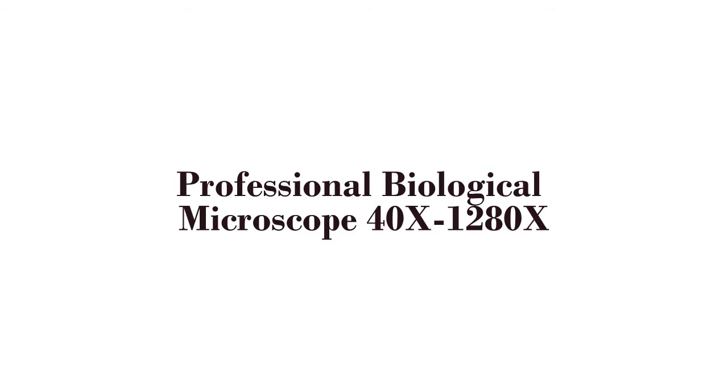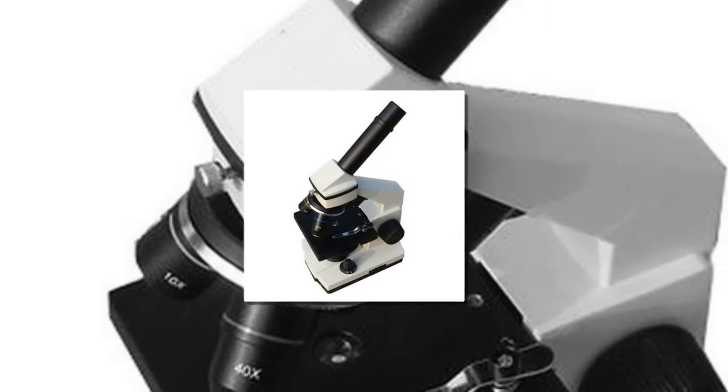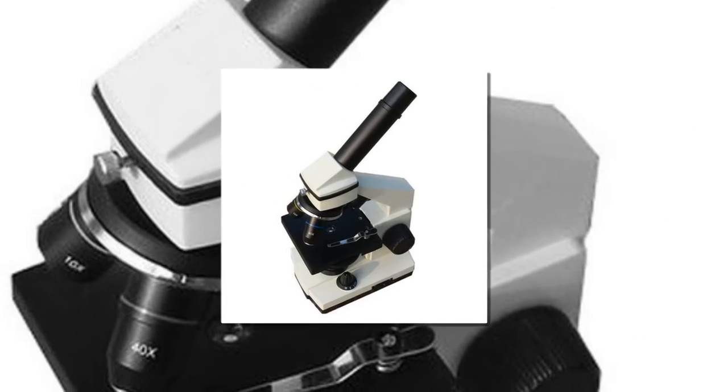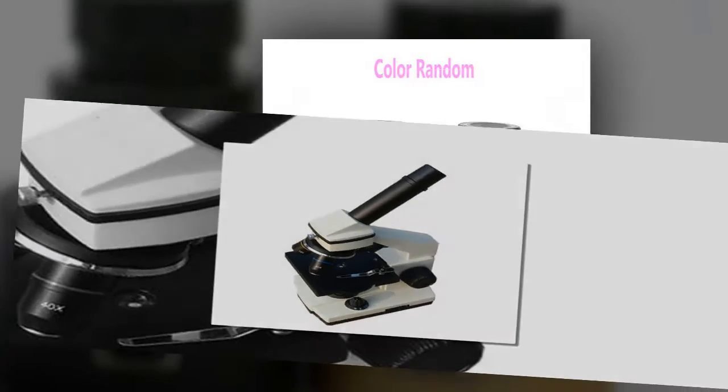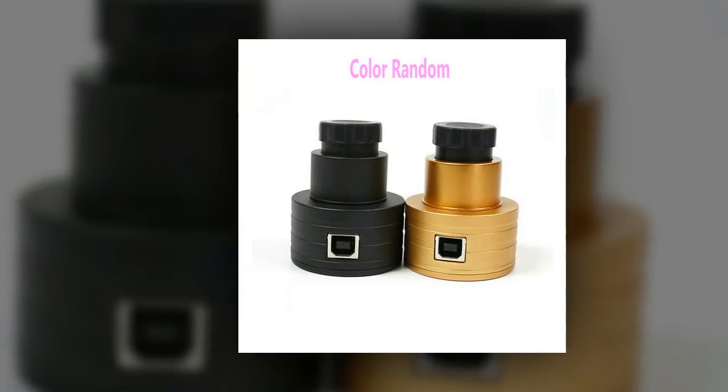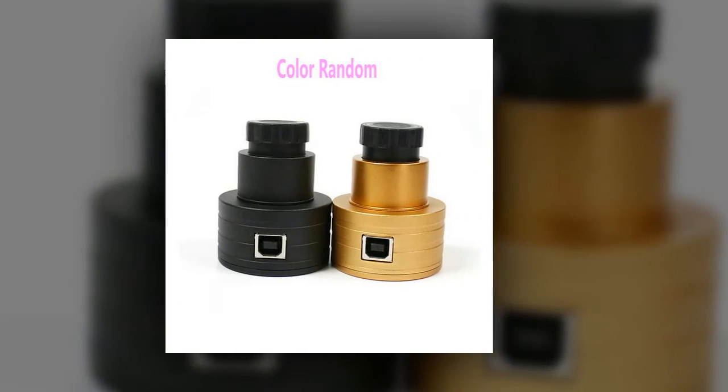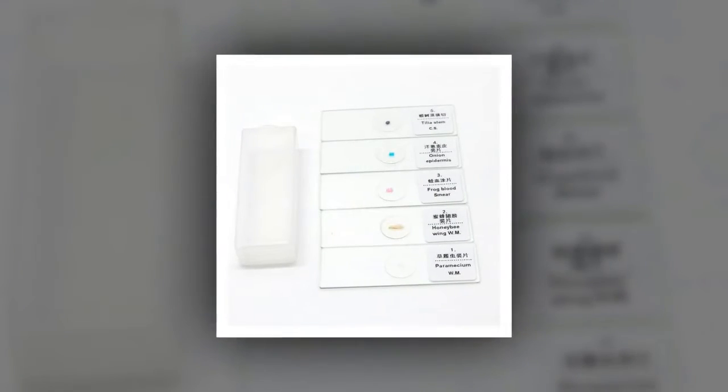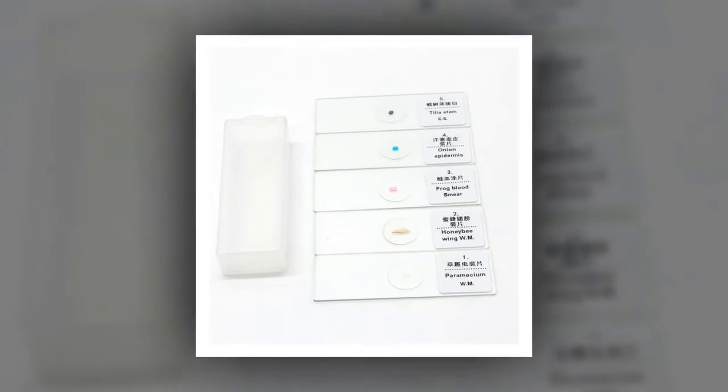Here is product number 3. Professional Biological Microscope 40X-1200X. This microscope is ideal for biological studies by students and adults. It is built to high optical and mechanical standards and designed to withstand daily classroom and laboratory use with minimum maintenance.